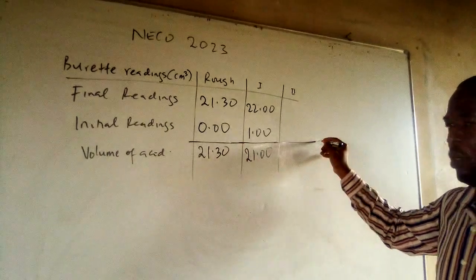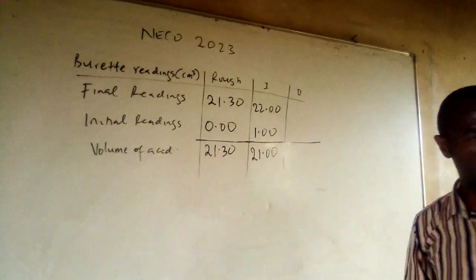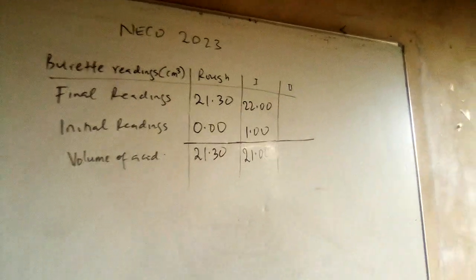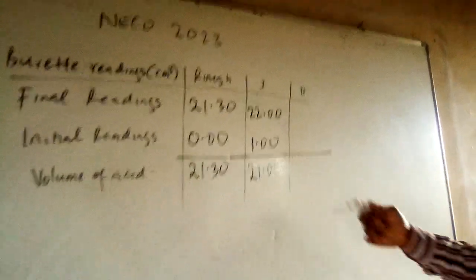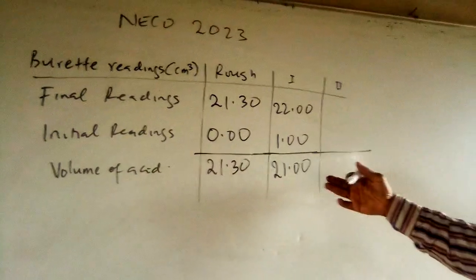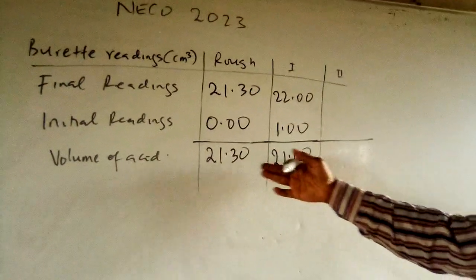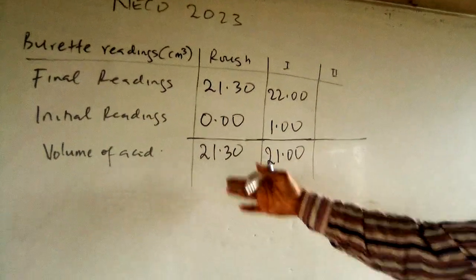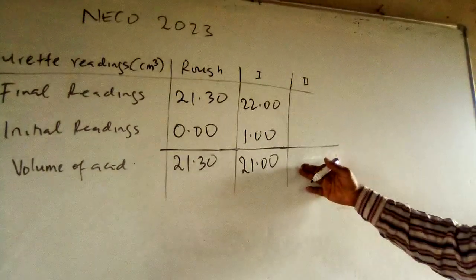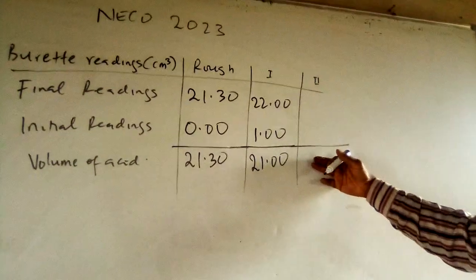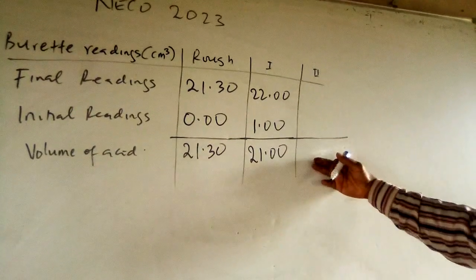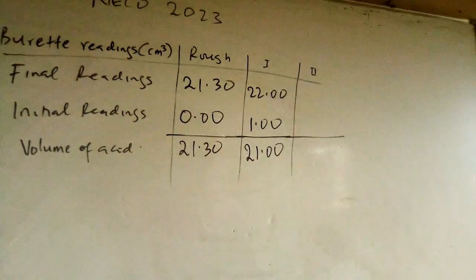Since 21.00 is more precise, we aim for approximately 21.00 cm³ in the next titration. The next initial reading will be set to approximately 2.00.